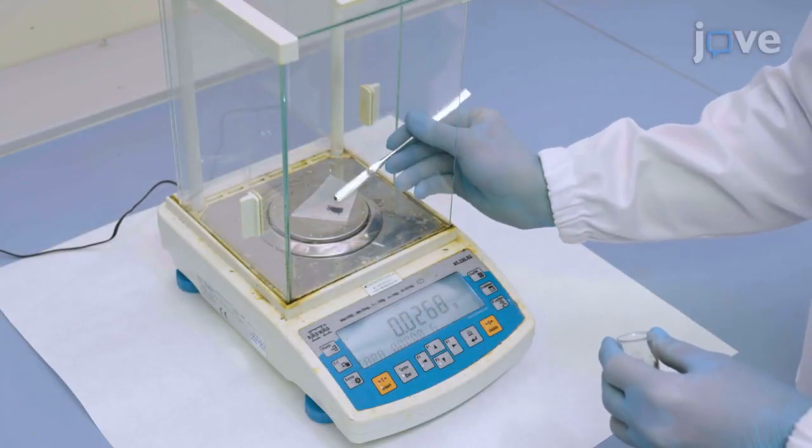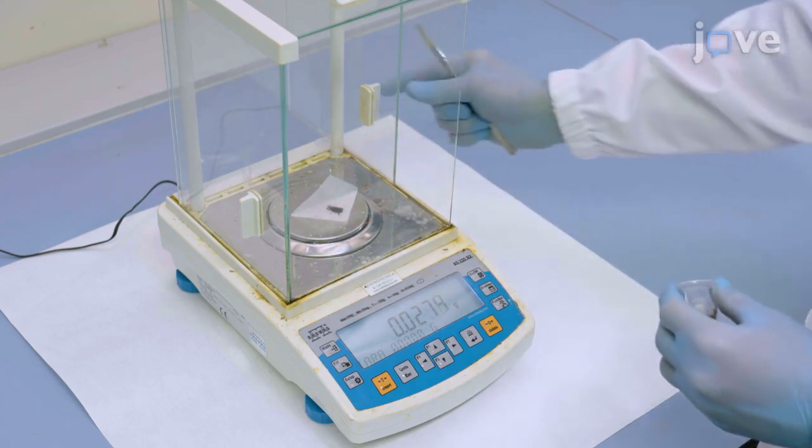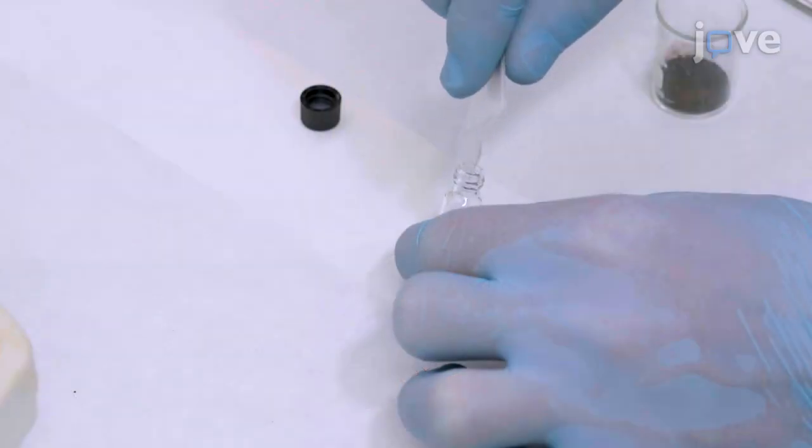To prepare the sample for NMR spectroscopy, accurately weigh about 30 mg of the sample in a 2 mL vial equipped with a stirring bar.